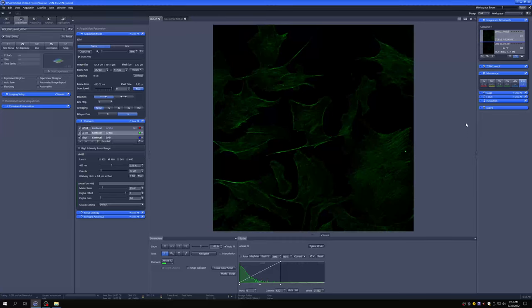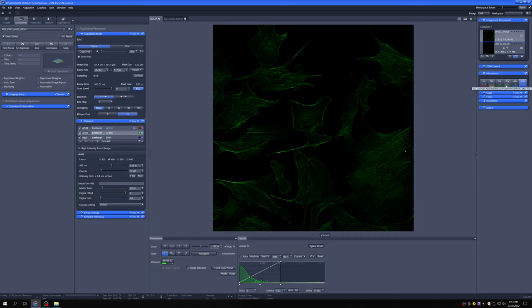A brief comment before we move forward, which is what objectives we have on the system. They're here. You can change them either here or on the touch screen. So what do we have available on the system?